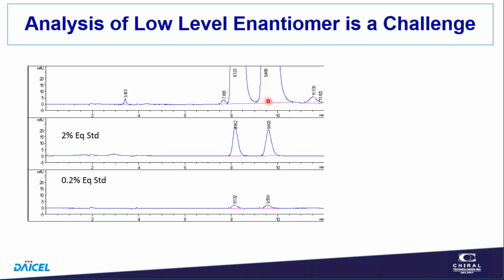If you just look at the chromatogram, you say, well, this is penetration to baseline. We do that all the time. Peak height was about 1,500 milliabsorbance units, so this is only a fraction of the peak height. So this is an insignificant amount of area of this peak that bleeds into this peak, but correspondingly, you get a similar amount of area from this peak bleeding into this one. So penetration to baseline is a reasonable way to do the integration for these two peaks, and it's very reliable.